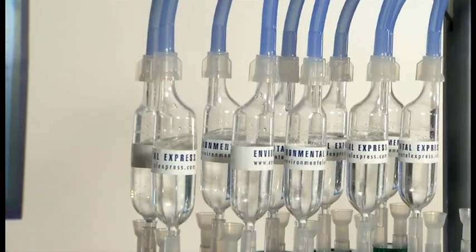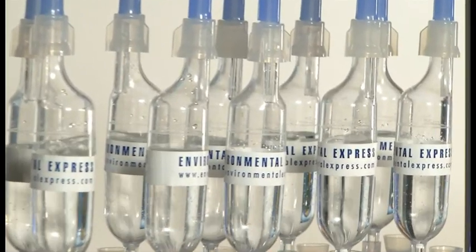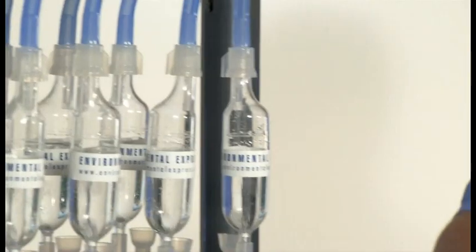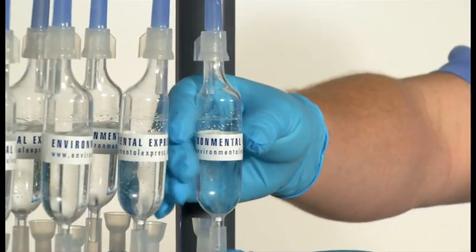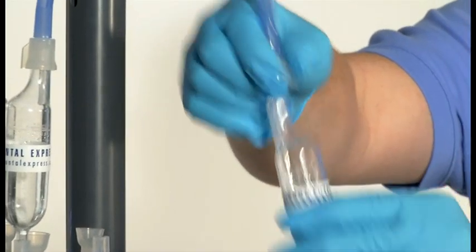After distilling for one hour, it's now time to disassemble the Simple Dist. It's important to keep the vacuum on during this process. First, remove the trap from the two-port cap. Now it's safe to break the vacuum by removing the tubing adapter.